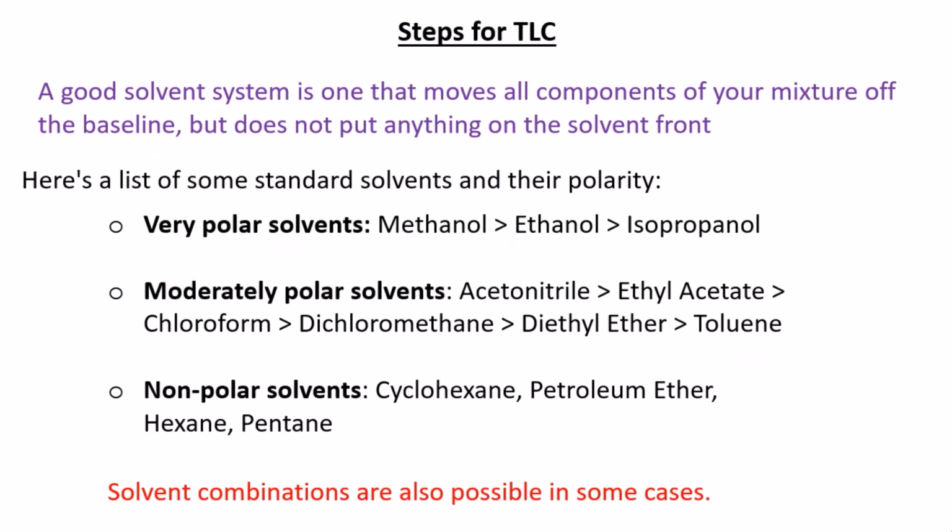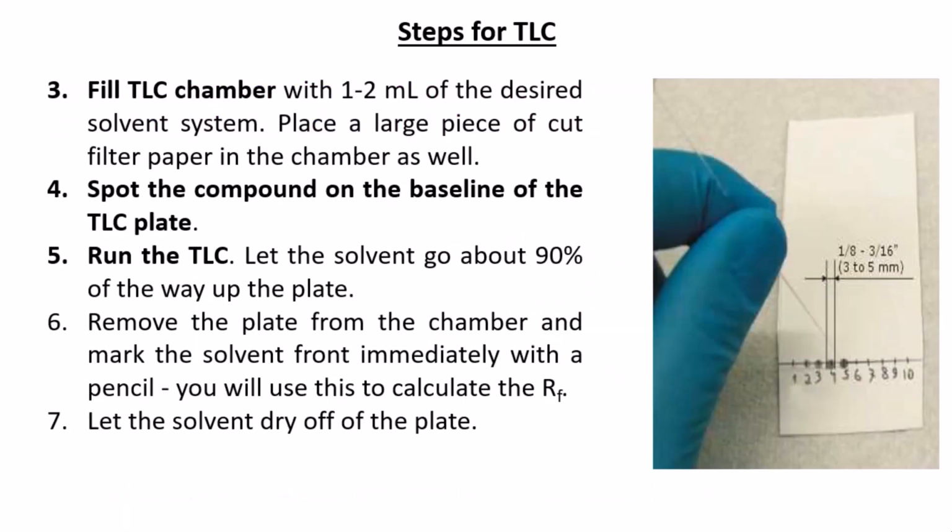Okay, so to run your TLC, you first of all get your plates. You mark the places you'll be spotting, right?